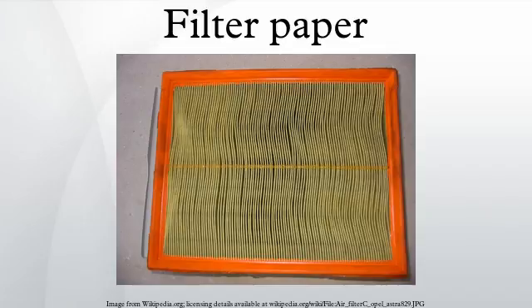Laboratory filters. Filter papers are widely used in laboratory experiments across many different fields, from biology to chemistry. According to different purpose and chemicals used in the experiment, the type of filter used will also be different. In most conditions, filter papers work with other laboratory techniques such as gravity filtration and vacuum filtration.